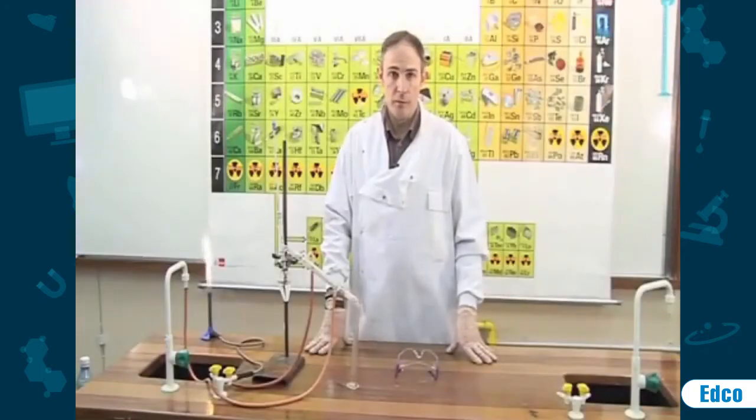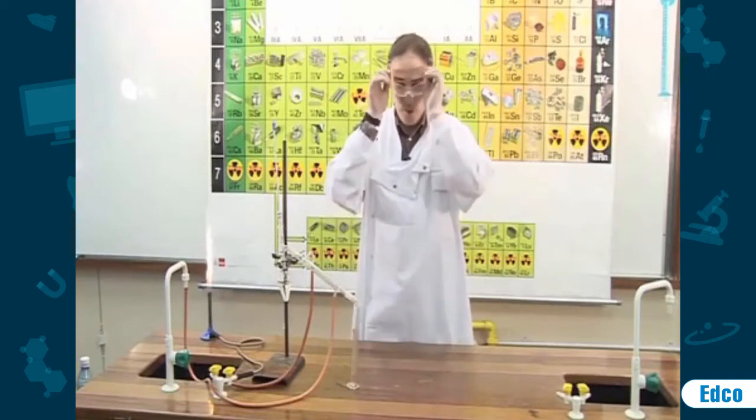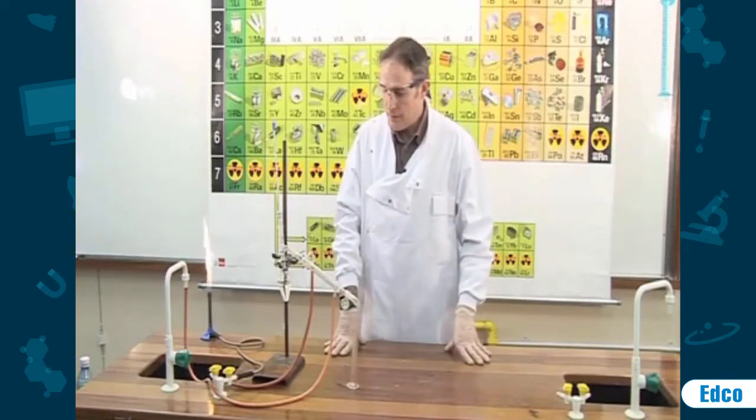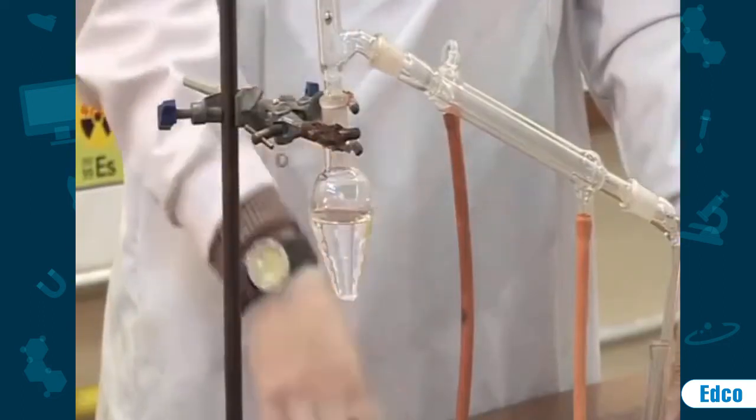To separate two substances by distillation, safety glasses must be worn as there are chemicals involved. In this experiment, we are going to separate a mixture of alcohol and water.